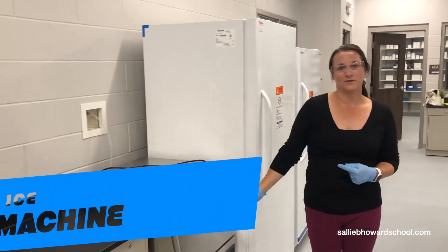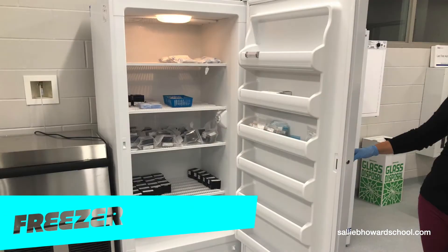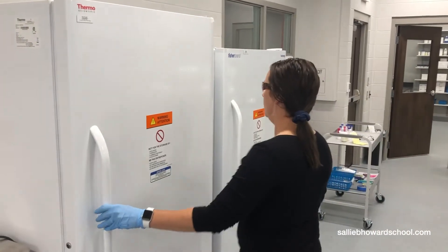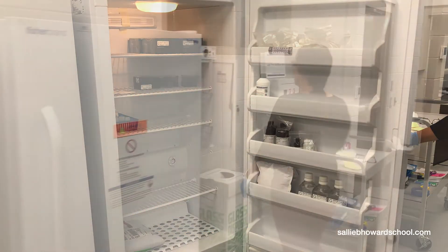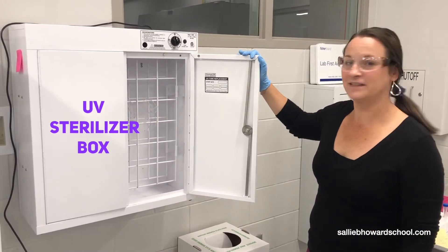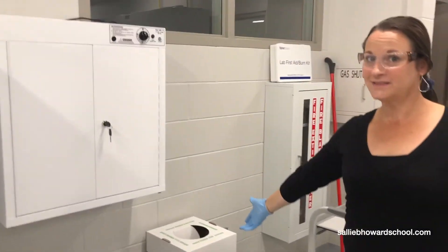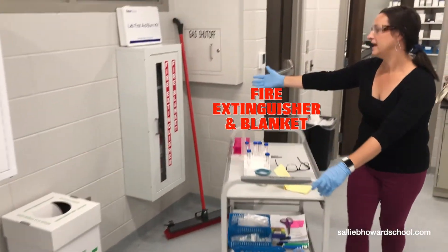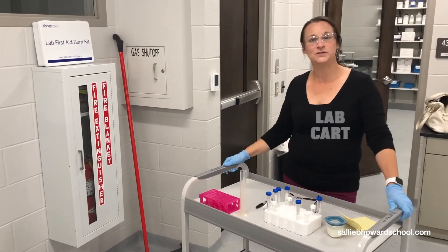We have an ice machine for when we need to cool things down, a freezer to store things that need to be frozen, and a four-degree C fridge for things that just need to be chilled. One of the most coveted pieces by most high school science teachers is a UV box to sterilize the safety glasses that students will be wearing every day. We also have a broken glass container, fire extinguisher and blanket, and a lab cart just to move things around.